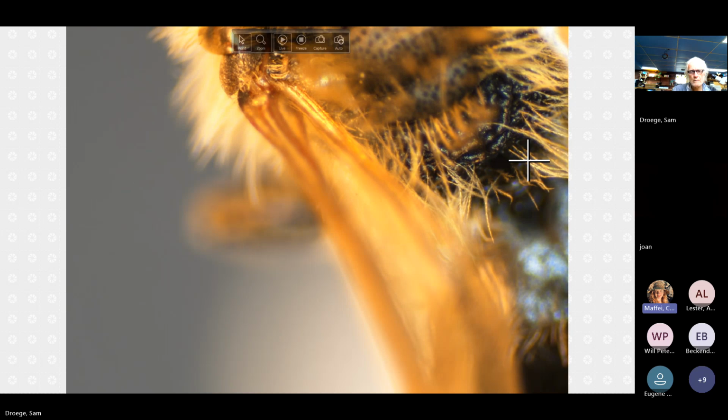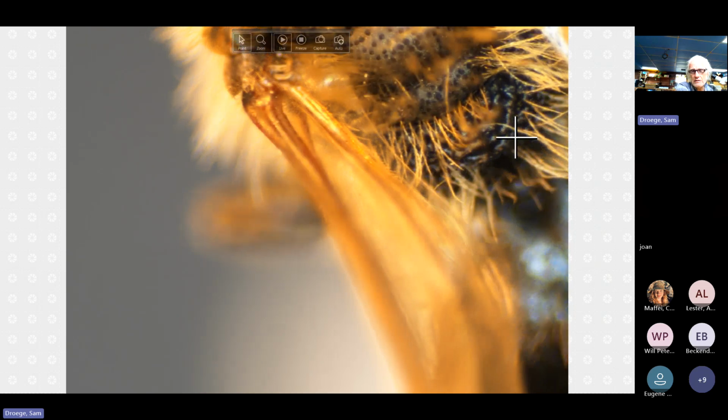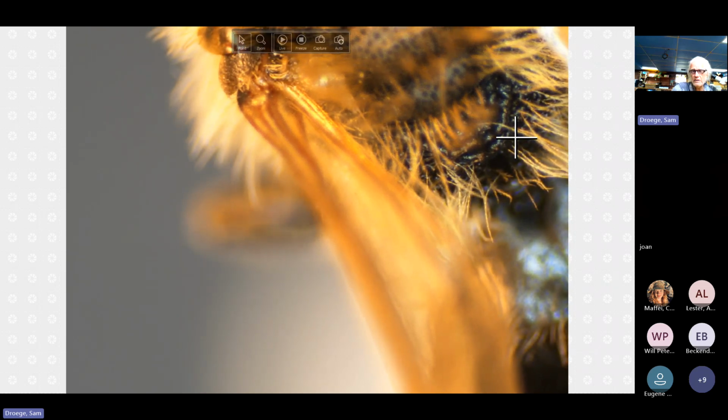Elysis is not included on your spreadsheet. So if, when you're talking, we want to go over it after this, that might be a good idea. Even though it's not a Trachandrena, unless I'm grossly mistaken, it is something that has to be separated out from the Trachandrena because it has a character here. And also, it's going to match in terms of orange leggedness, the Hapotes.